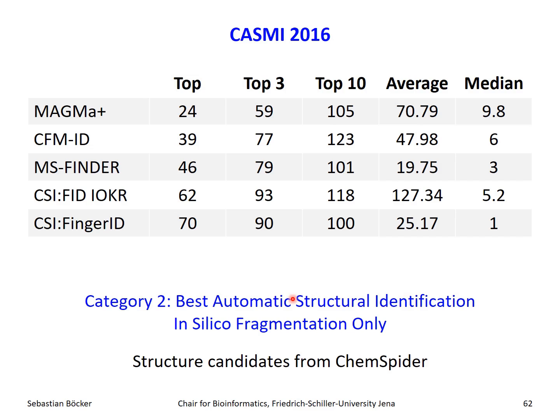And here's CSI FingerID. Oh no, here's also CSI FingerID. How is that possible? Because there's a second version of CSI FingerID, which uses the setup of the multiple kernel learning, which I told you is the most important change in CSI FingerID. The rest is, in comparison, relatively small.